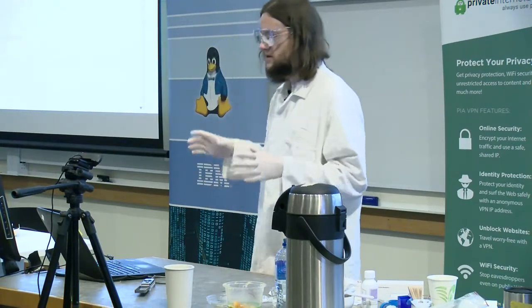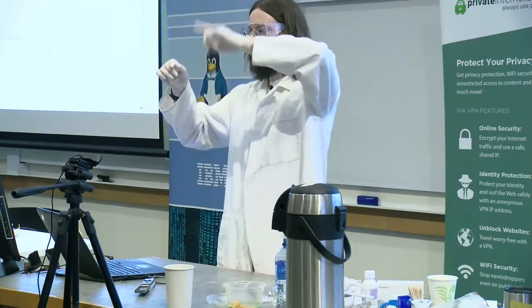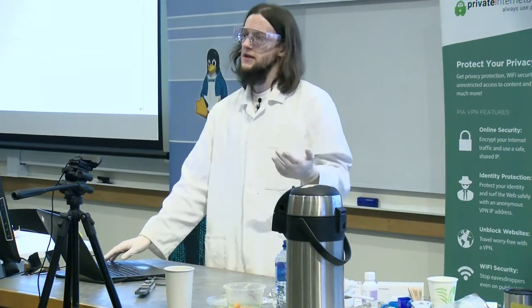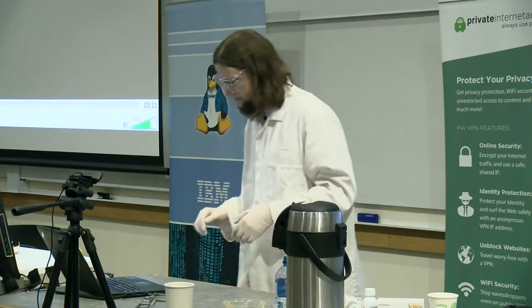This DNA sequencer sequences DNA via electrical signals. As DNA goes through a pore, it alters an electrical signal, and you can express that as sound. So that's the sound of DNA going through a nanopore which has been frequency modulated.